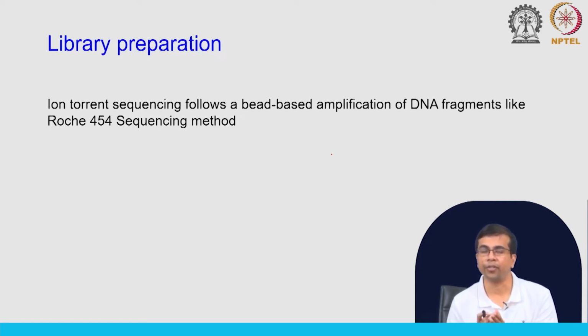Ideally each bead should contain copies of a single molecule. Sometimes this might not happen, and those will give out confusing signals, which will be filtered out later during data processing.